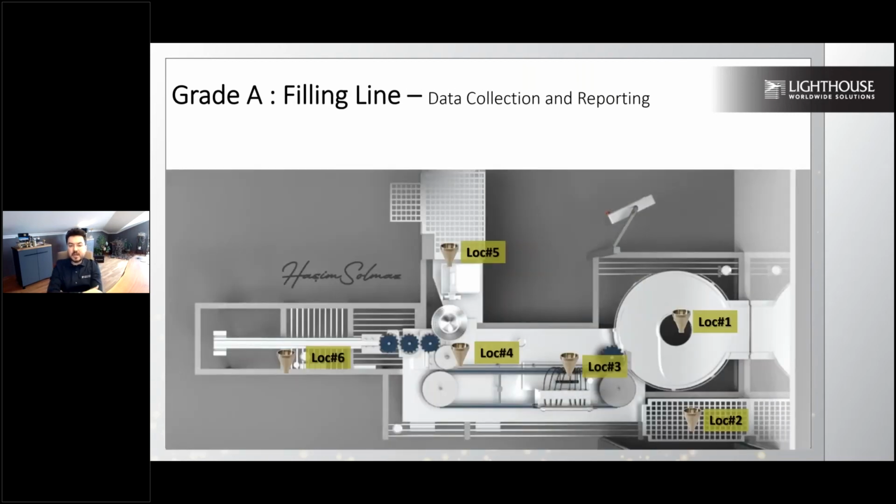So, data collection and reporting. We'll be moving into the next part. We'll be collecting data from these locations, number 1, 2, 3, 4, 5, and 6. And we will be preparing our report based on this information.